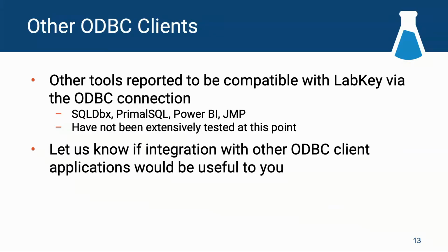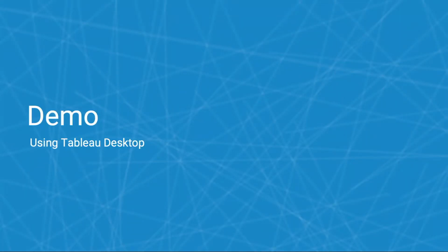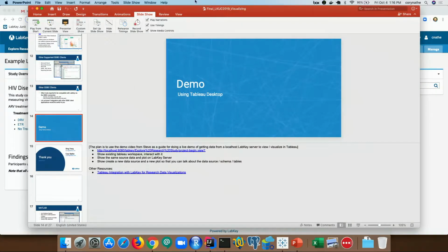And now I'll hand this back to Corey for demoing visualizing LabKey data using Tableau. Great, thank you. Some of you may have seen that Steve from LabKey has created a great demonstration video of this Tableau experience. I'm using the same data source that he did and want to show you how some of that was set up and how that connection was made.